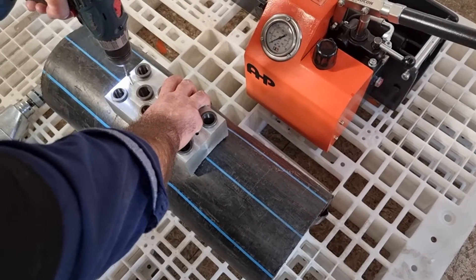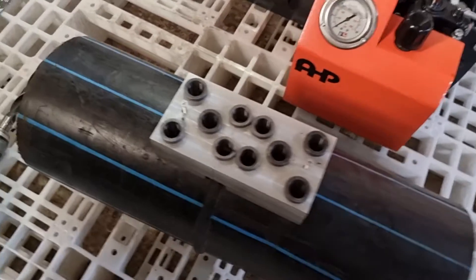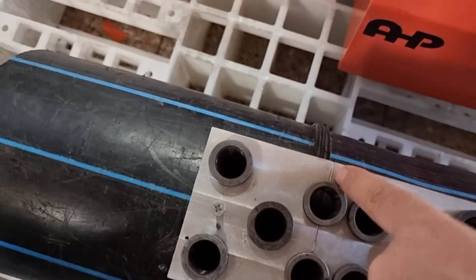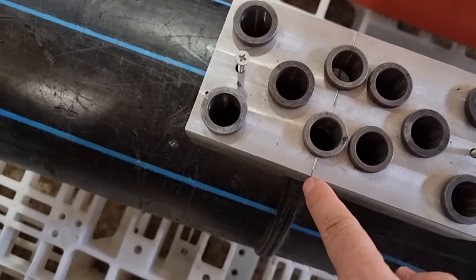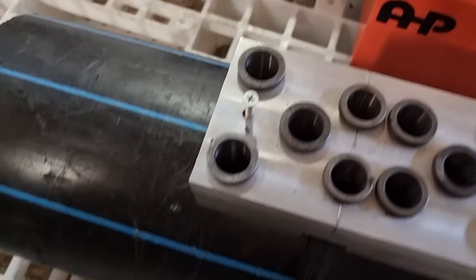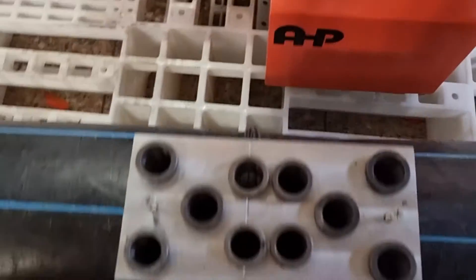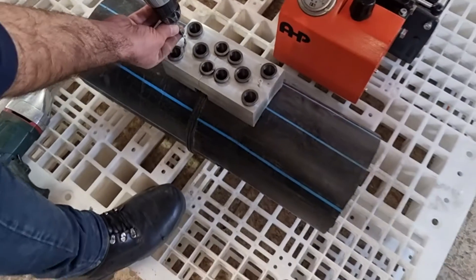As I'm showing, first I need to fix the template to the pipe. You need to adjust the center line — there is a line on the template — and you need to align that line exactly in the middle of the butt weld, then fix the template in place.